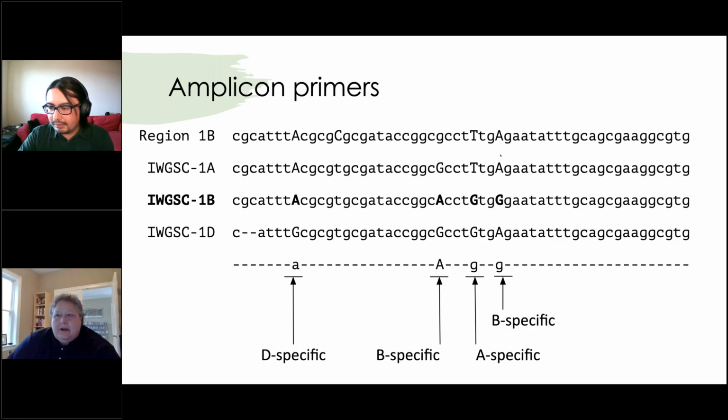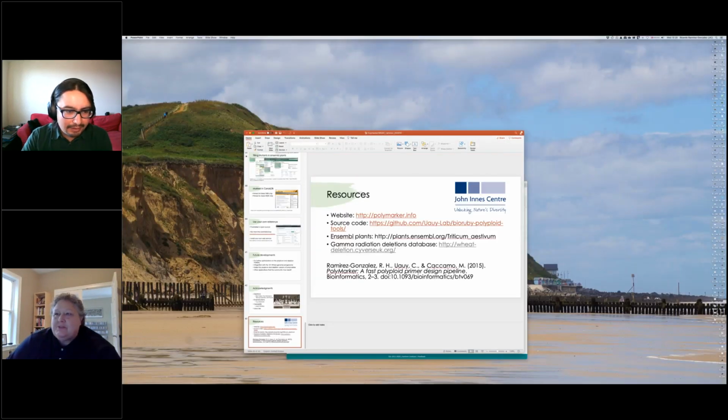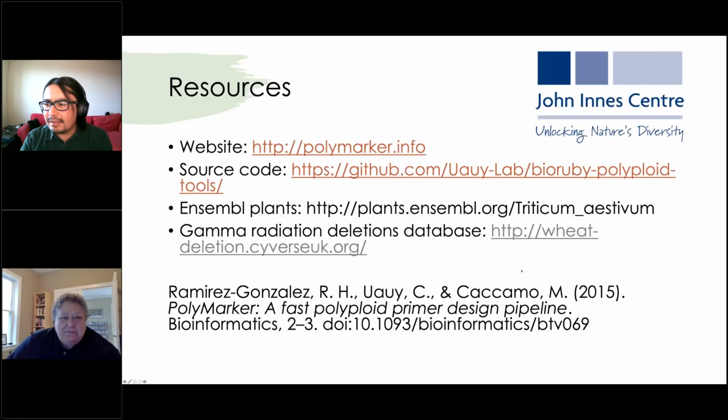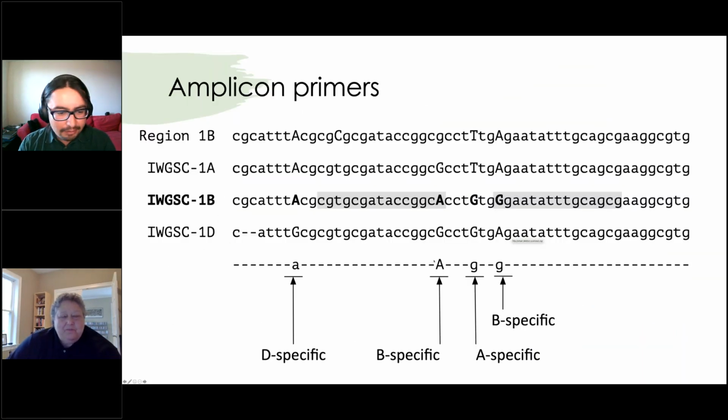All right. While you're on that page, what does the capital and small letters in nucleotide sequence signify? What is the what? Sorry. What does the capital and small letters signify? So in this case, I'm marking with the capital our target sequence.